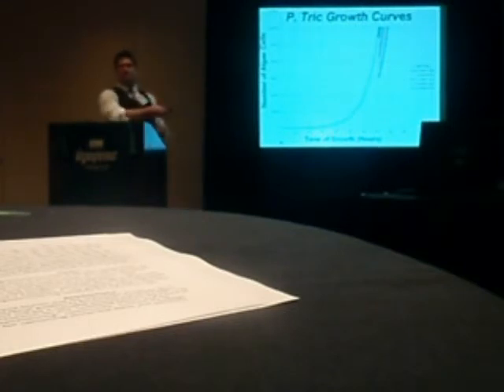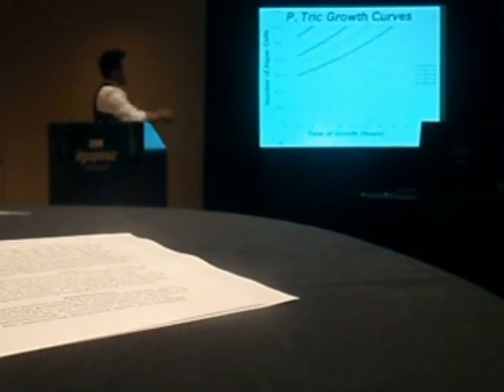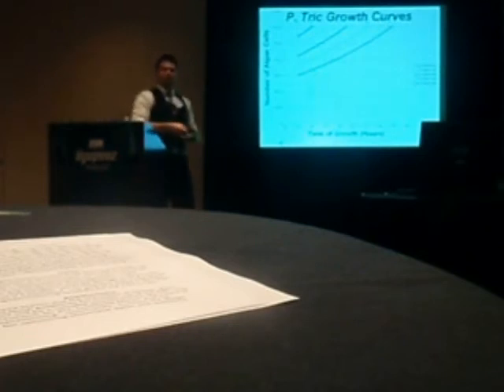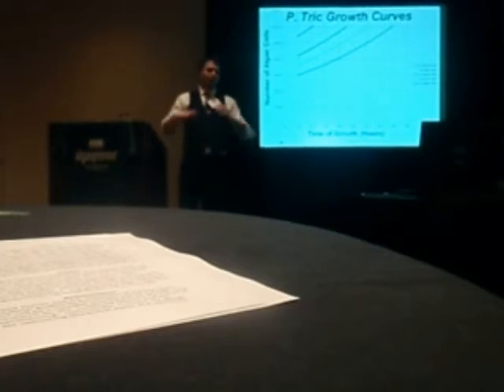So you'll get this exponential growth. And if you can maintain that exponential growth, if you batch out, the next one will show it a little more clearly. If you batch out smaller intervals more frequently, you're going to be able to maintain a higher rate of production.